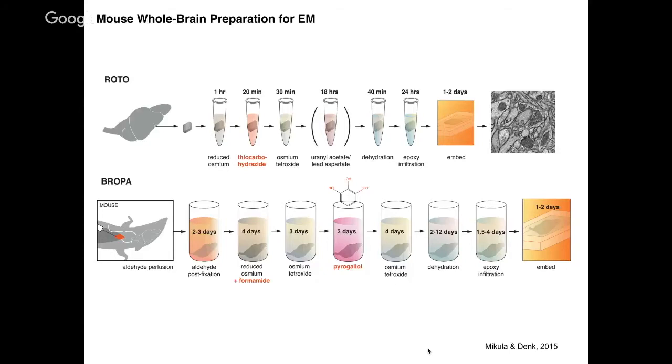It seems like it solubilizes things that would otherwise precipitate in solution and build up to form this diffusion barrier to further diffusion of the stain. The second thing I did was just modify or replace the TCH that was in the standard protocol, because this was liberating nitrogen gas and causing ultrastructural damage in large samples.